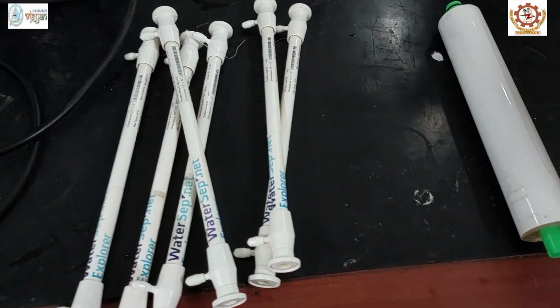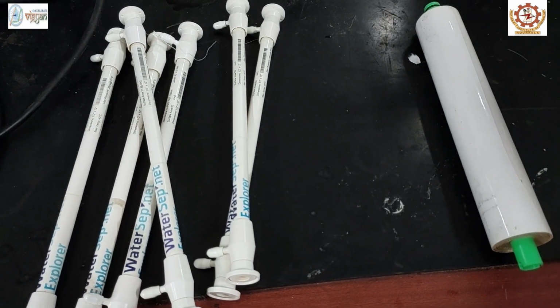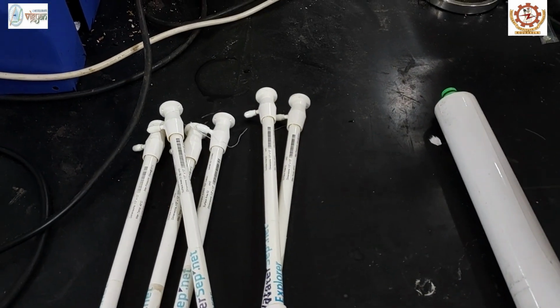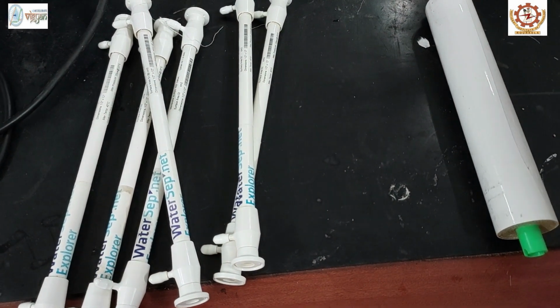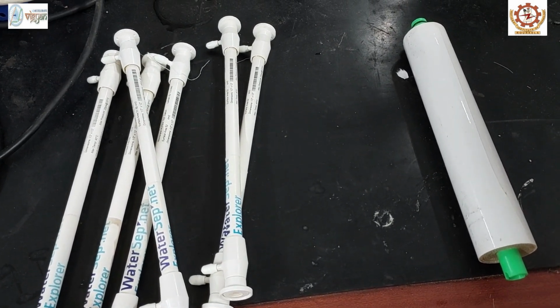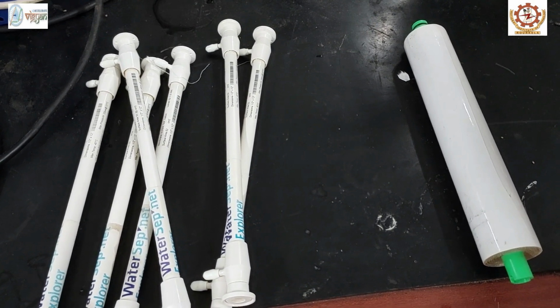That is, in inside out mode, the feed flows along the inner side of the membrane fiber and the final product comes out through its outer side. Whereas in outside inside mode, the movement of feed is from the outer area of the membrane fiber and the permeate collects at its inner side.